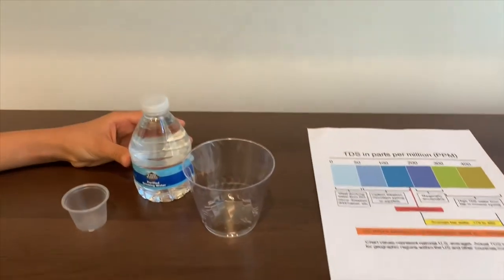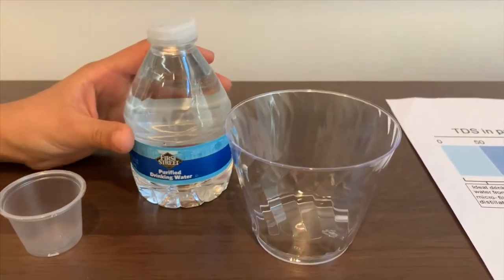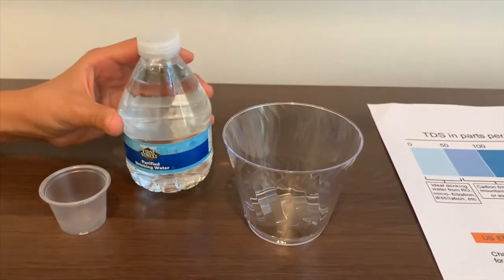This is First Street Purified Drinking Water from the Niagara brand. Let's pour some water in to test the pH and TDS level.